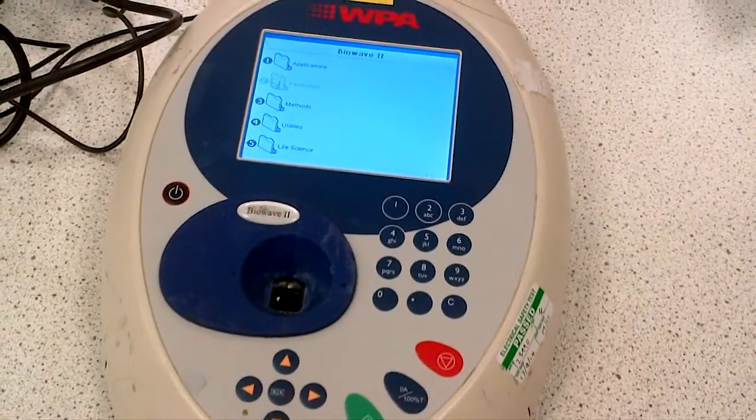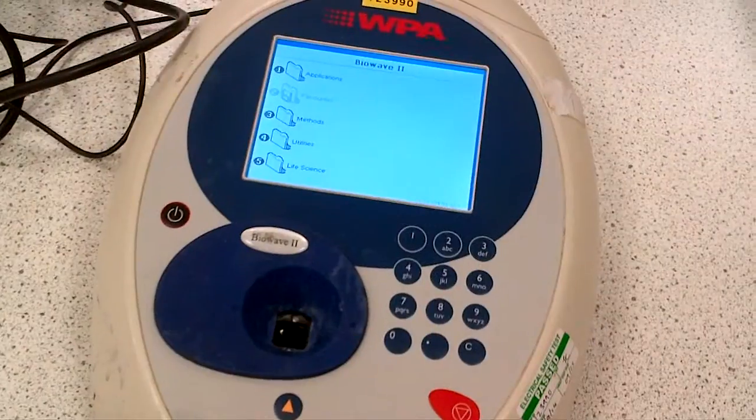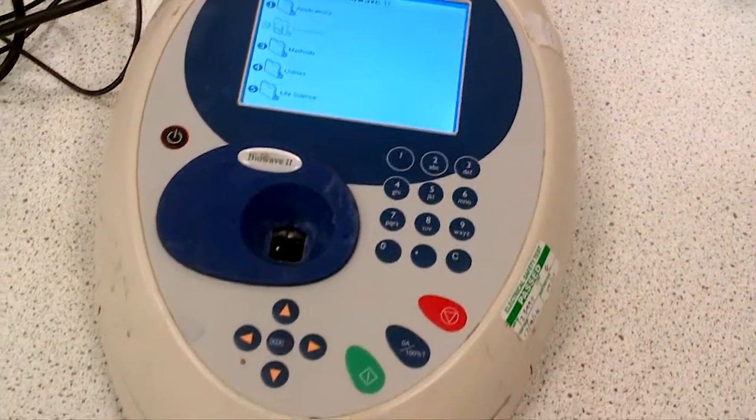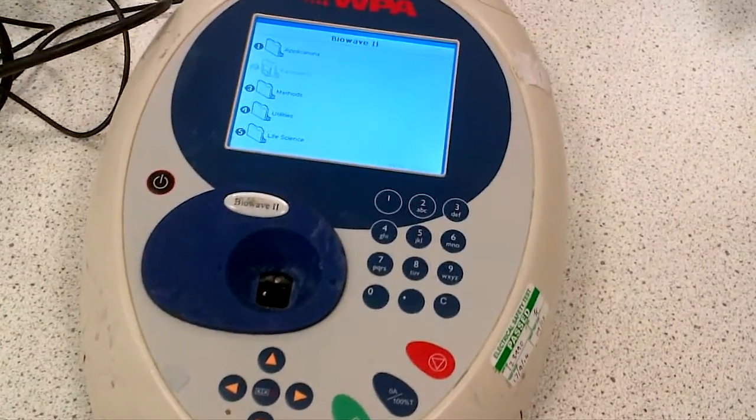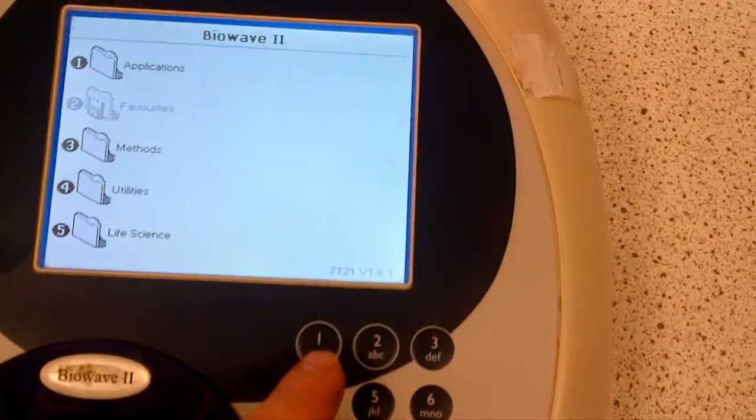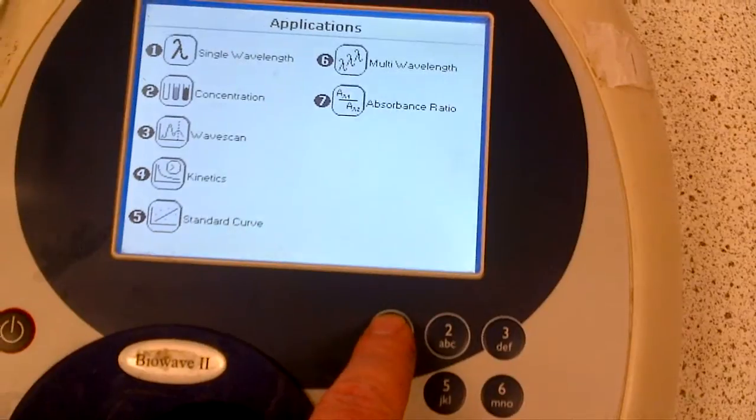So here's this WPA spectrophotometer. After plugging it in and making sure that the power is on, to set it to wavelength, which I'll just show you today, all you need to do is look at applications on the screen and simply press number 1 for applications to set it to single wavelength.